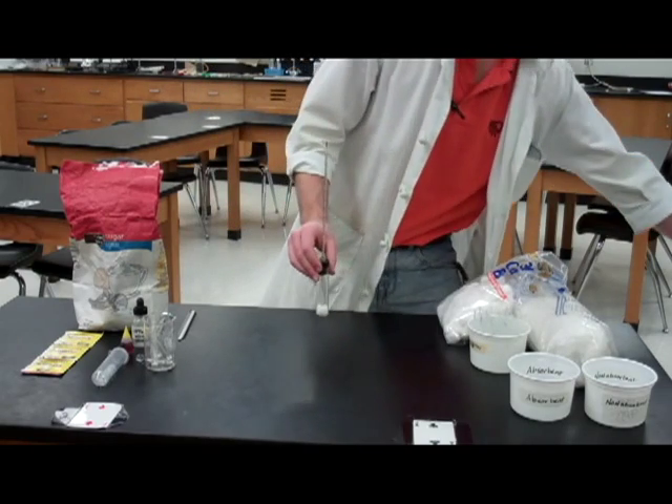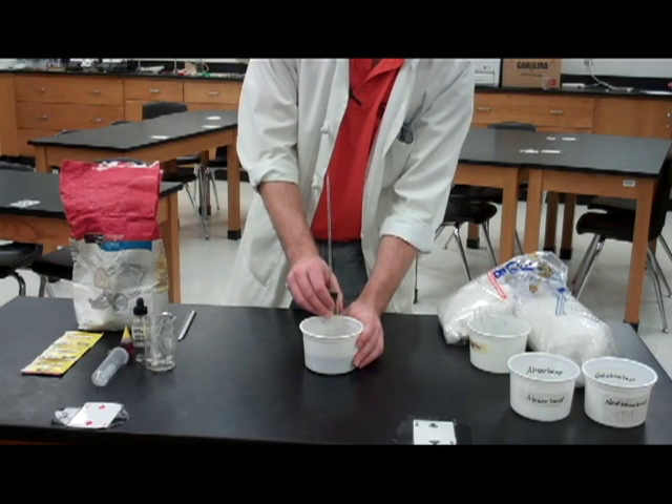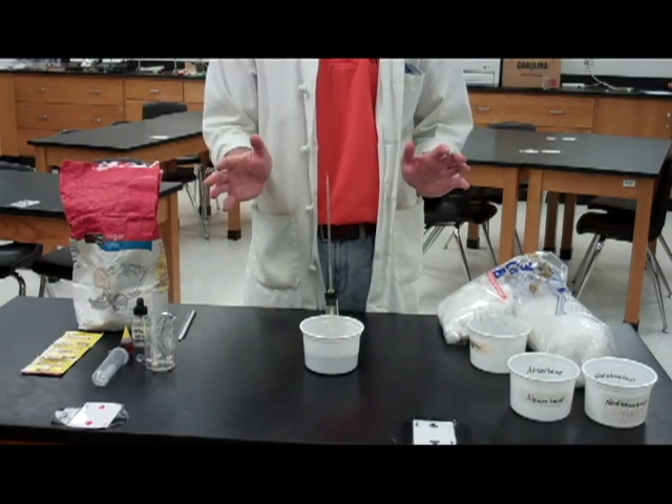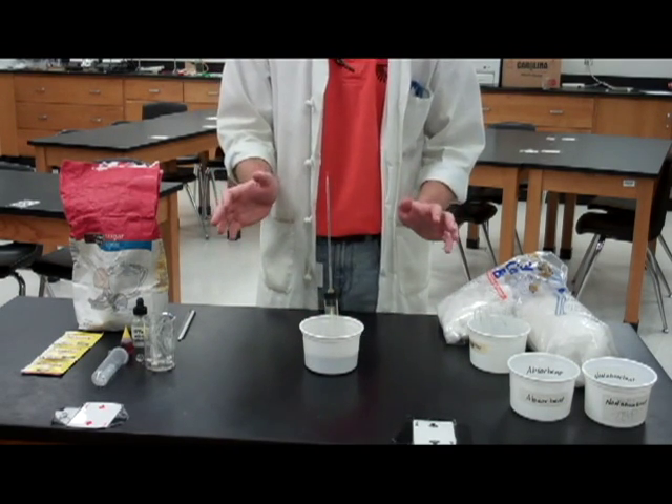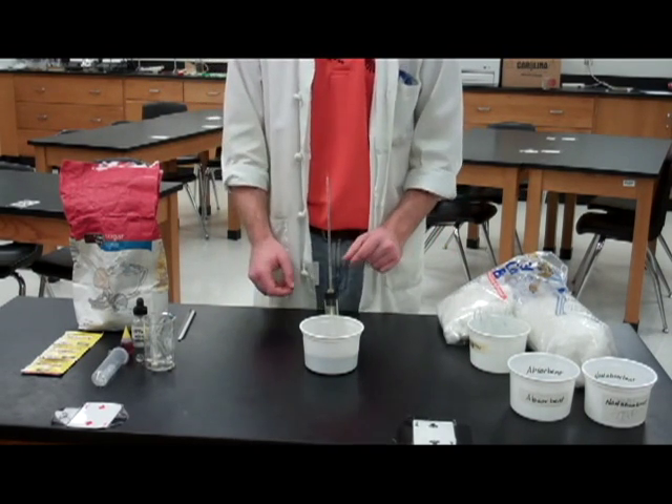To finish up, use a sand bath to provide some stability to your system and then leave it alone. It's very sensitive to pressure or temperature changes, so let it sit and record data periodically as respiration proceeds in your chambers.